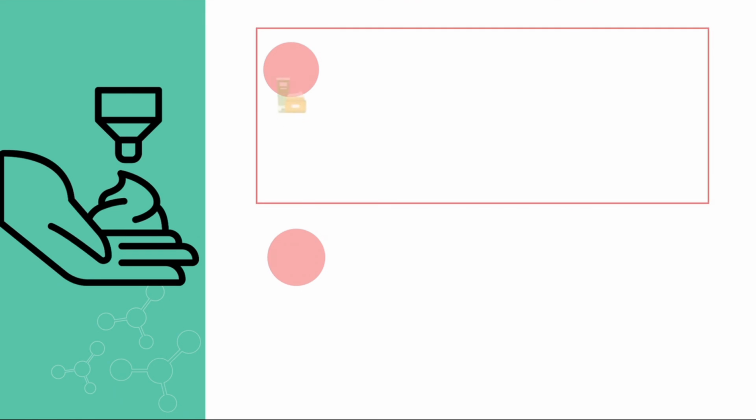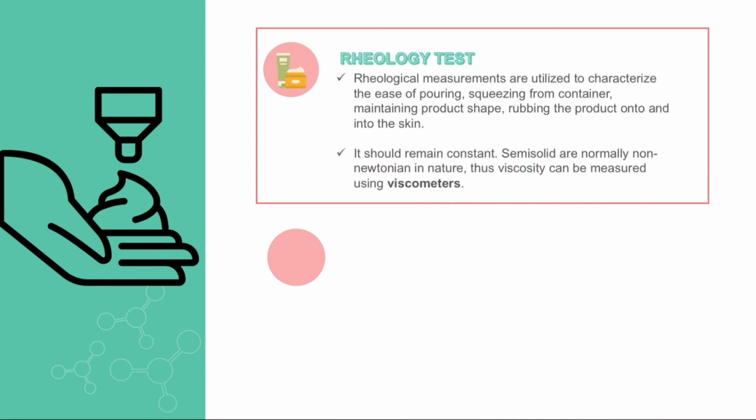Third test is the rheology test. Rheology is very important as these creams are marketed in tubes or containers. The rheology or viscosity should remain constant, as these products are normally non-Newtonian in nature. Viscosity can be measured using viscometers used for such liquids.